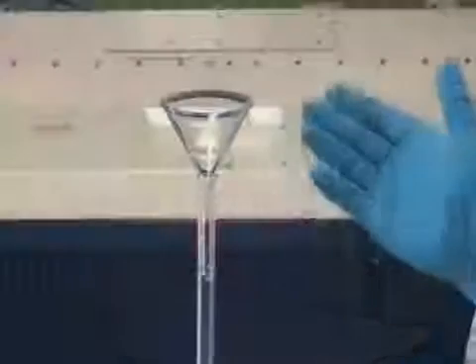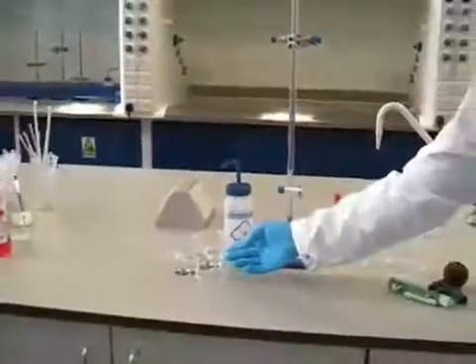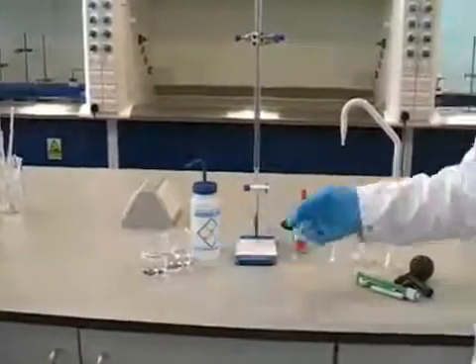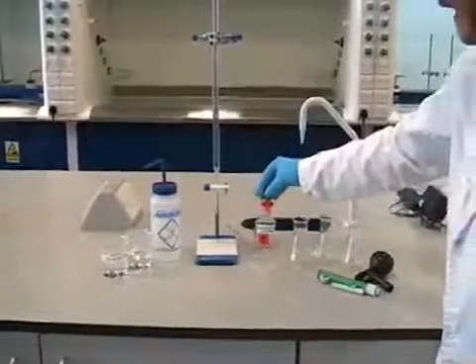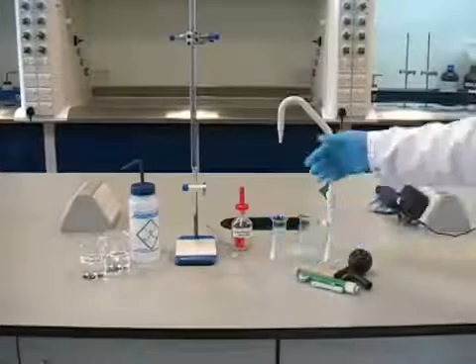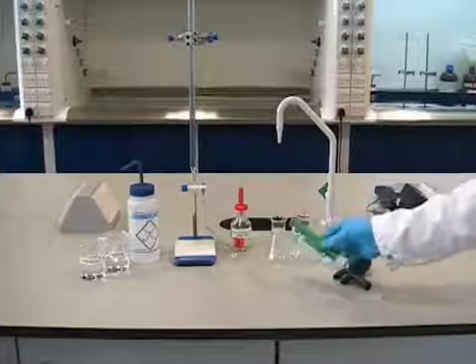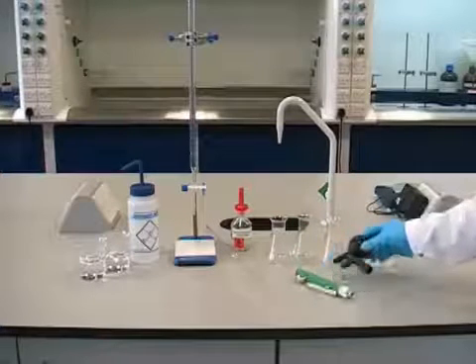Before filling a burette, we should make sure we've placed a small glass funnel in the top. We should also make sure we've got the rest of the equipment we need, including solutions, distilled water, a suitable indicator, in this case phenolphthalein, a 25 milliliter volumetric pipette, 3 clean conical flasks, and a pipette filler. 2 examples of these are shown on the screen.